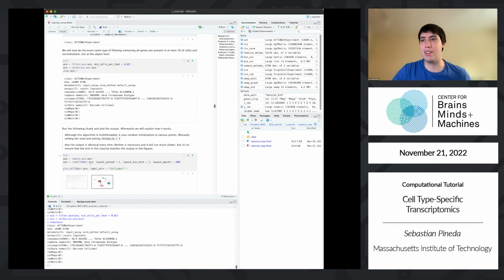And then we're going to run this algorithm. It's going to do a couple of things. It's going to take that. It's going to decompose our already reduced representation using the archetypal analysis algorithm. It's going to create a new representation based off of, by default, the 30 most extreme data points. And in theory, these data points are sort of the canonical profile of our various cell types.